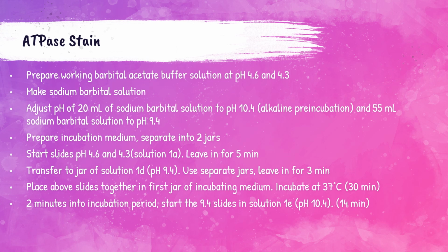2 minutes into the incubation period, you want to start the 9.4 slides in solution 1E, which is at a pH of 10.4 for 14 minutes. Let's continue on the next slide.